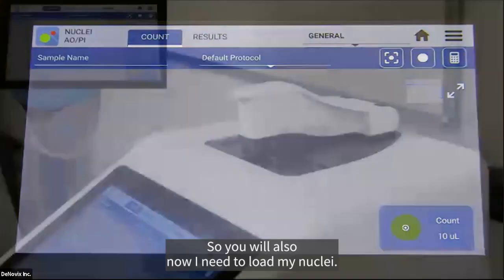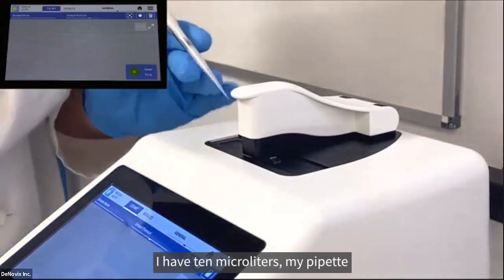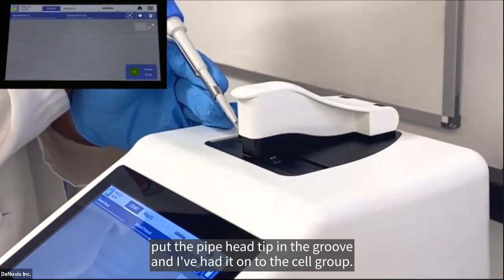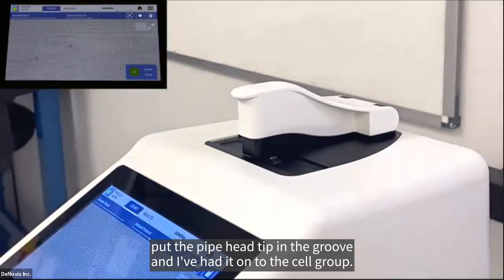Now I need to load my nuclei. While I was talking, I was resuspending my sample. I have 10 microliters in my pipette, and I'm going to, just like the cartoon showed a minute ago, put the pipette tip in the groove and pipette it onto the Celldrop.